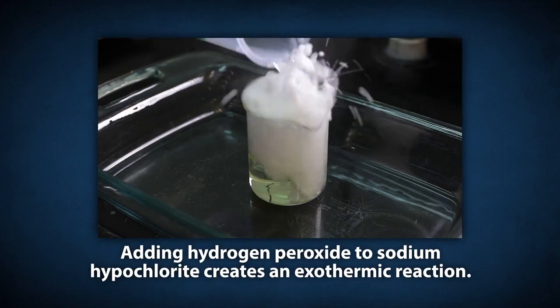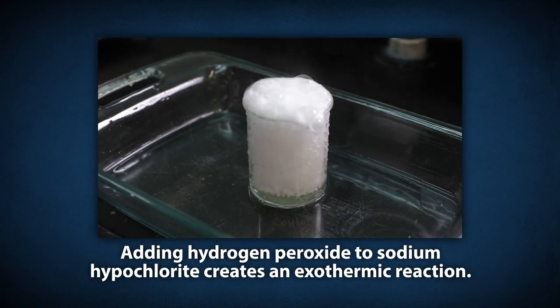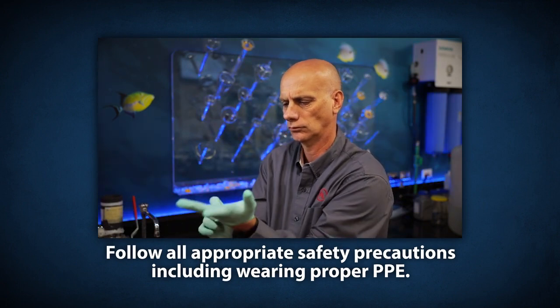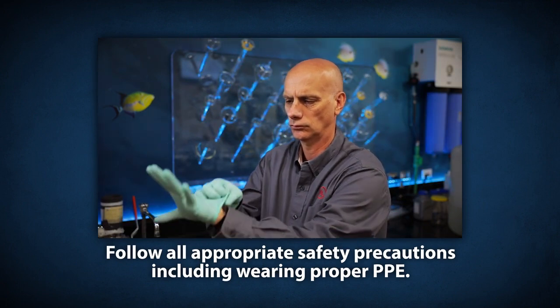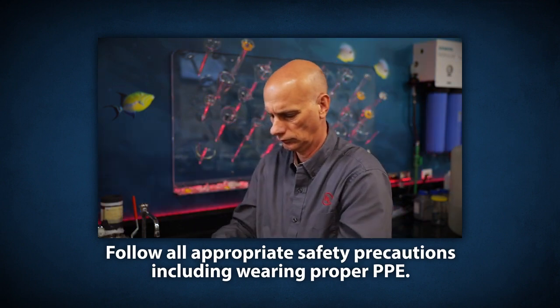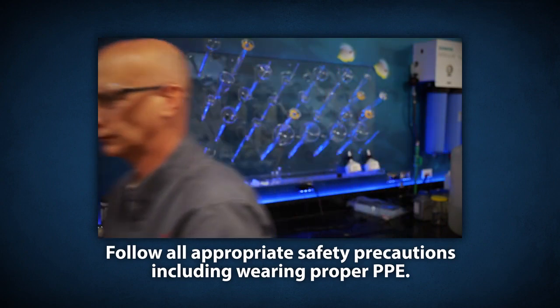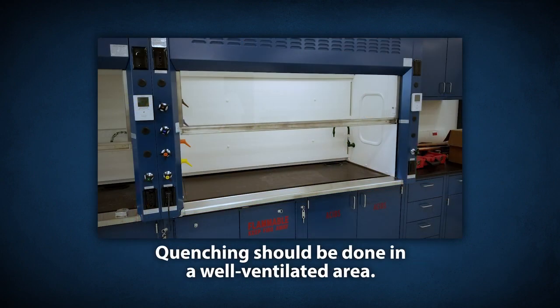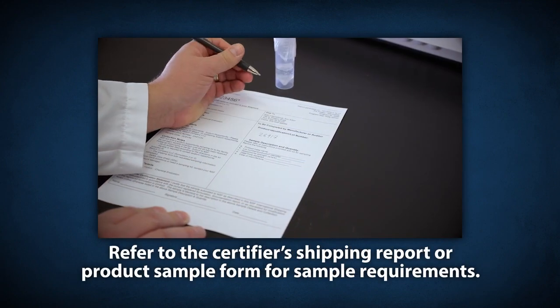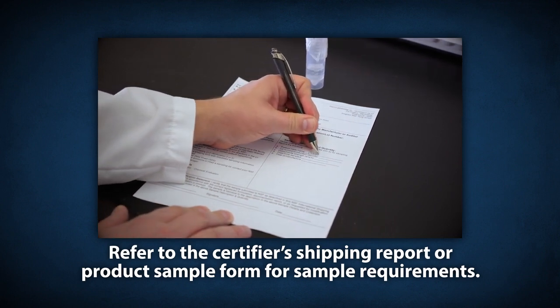The addition of hydrogen peroxide to sodium hypochlorite is an exothermic reaction that could cause a violent evolution of gas and heat. For this reason, follow all appropriate safety precautions including, but not limited to, wearing the appropriate PPE based on your company's policies and procedures for eye and respiratory protection, a long-sleeve shirt and gloves. Quenching should be done in a well-ventilated area or under a fume hood if desired. Refer to the certifier's shipping report or product sample form to determine the specific sample that requires collection.